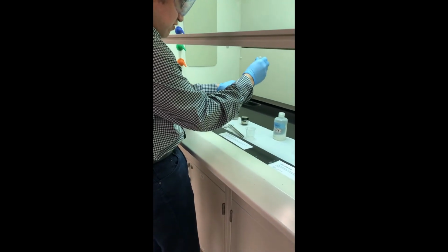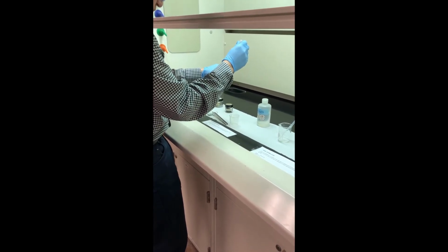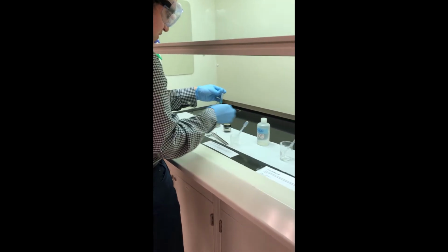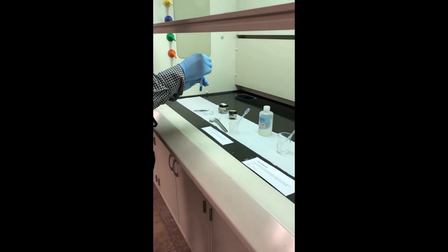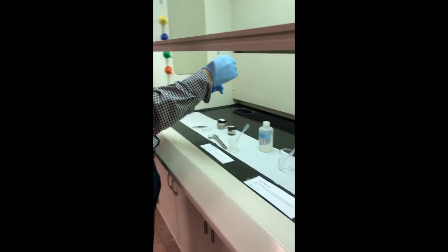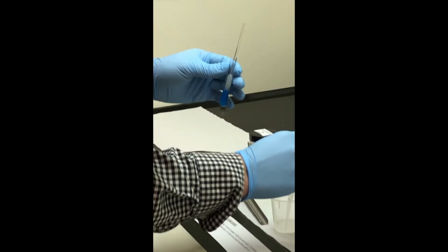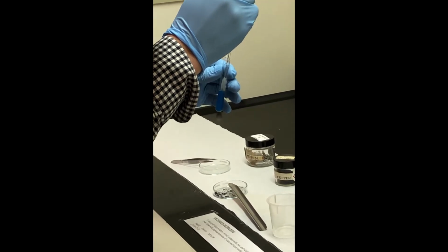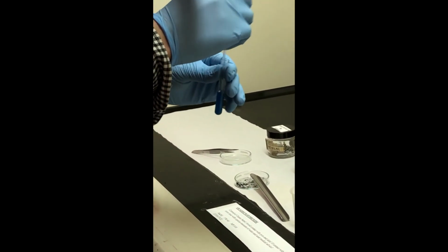So let's add another 10 drops. Let's now agitate with our rinsed stirring rod. So note we're cleaning it in between each step. Notice the pretty dramatic color change. Now another 10 drops. Okay, let's continue to stir to complete the reaction.